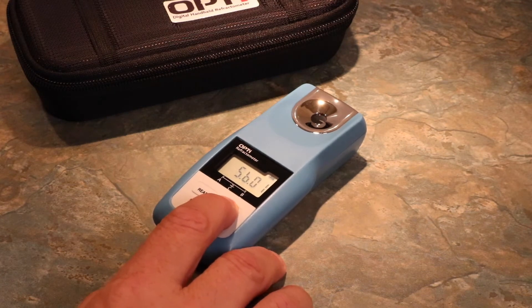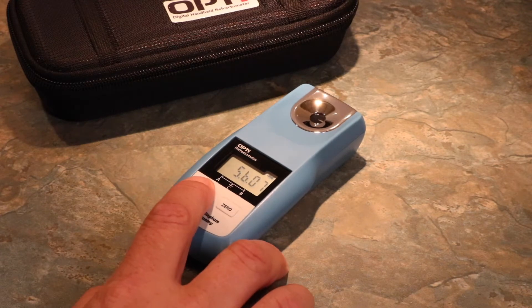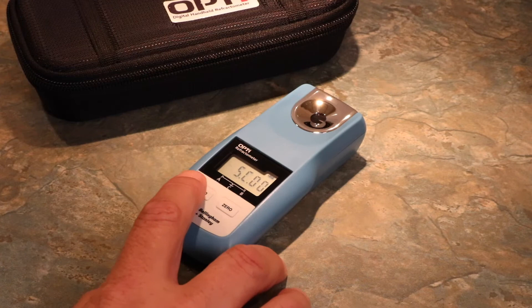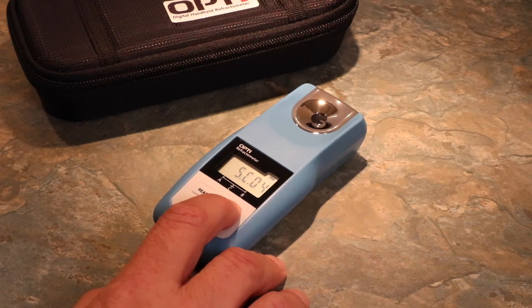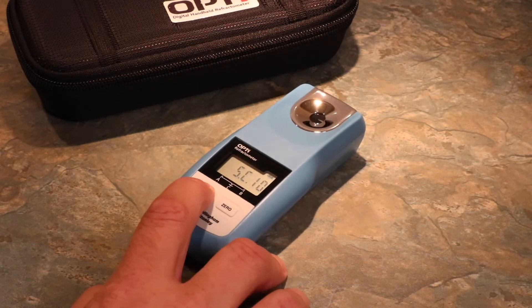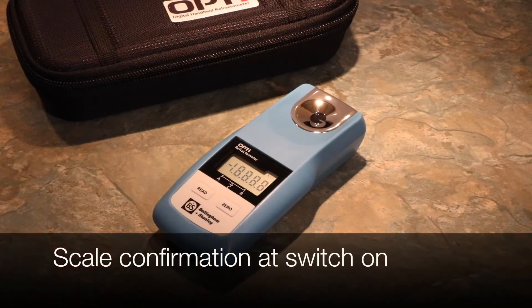Cycle through the available scales by pressing Zero and confirming your selection by pressing Read. In the example, we have chosen Scale 7. We can now cycle through the other options for Scale C. Once assigned, your Opti now has three scales easily accessible. Now that the scales are loaded, the Opti will display the chosen three options to you when you switch on.